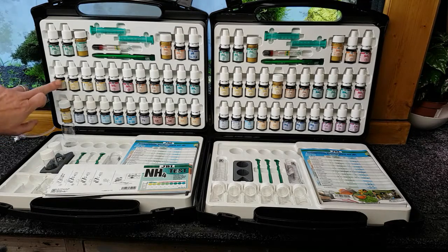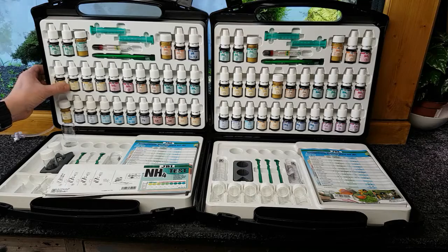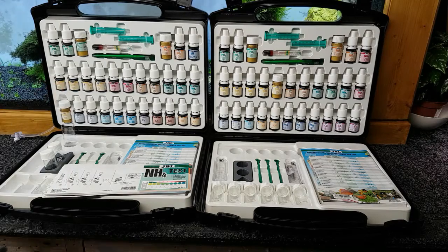And we've got the silicate as well. Now, silicate tests, if you're not really familiar with them, you get a lot of silicates in the stones. It's harmless. Silicates are completely harmless, they're not going to do you any harm. It's in your drinking water. It's stronger in some places than others. You get more because it leaches from the stones into the waters, into rivers, and it's just natural.